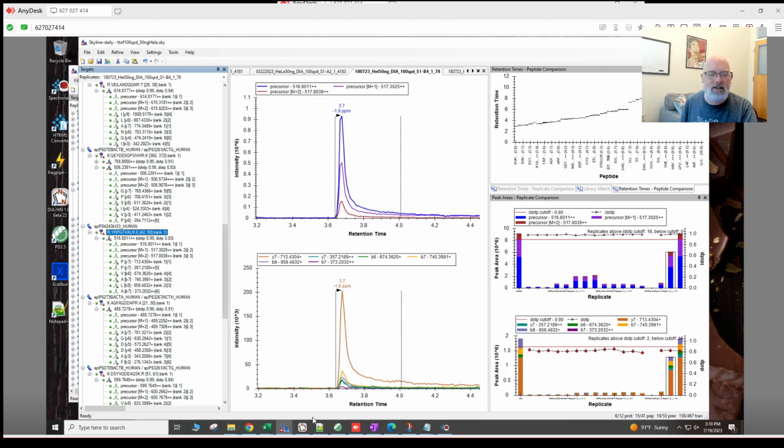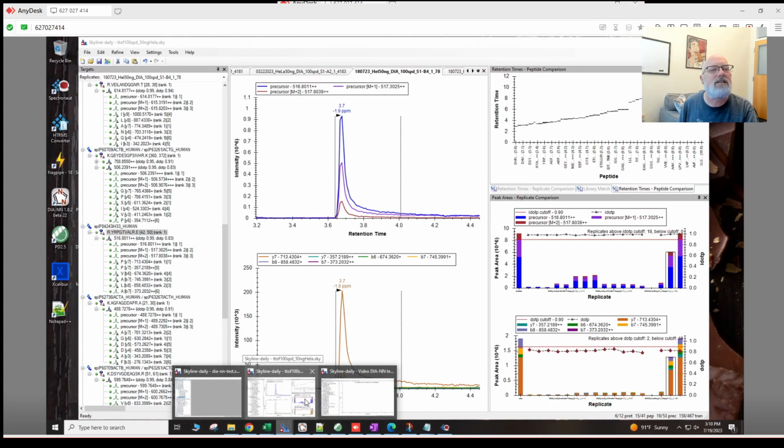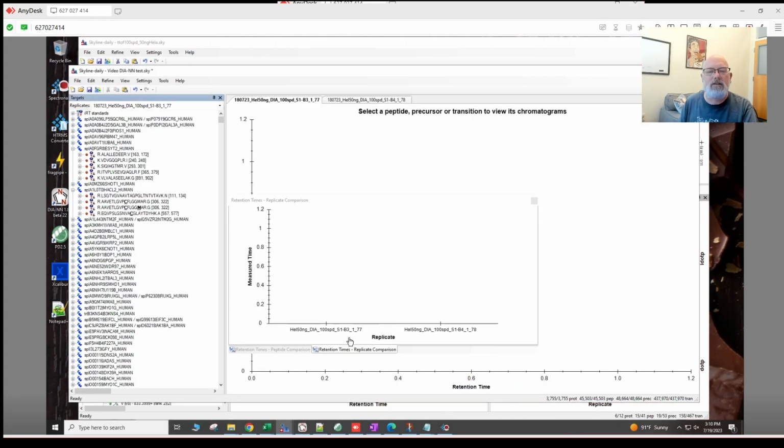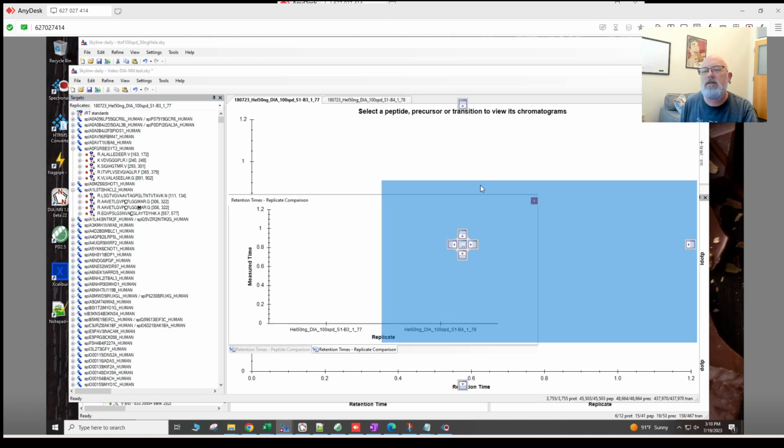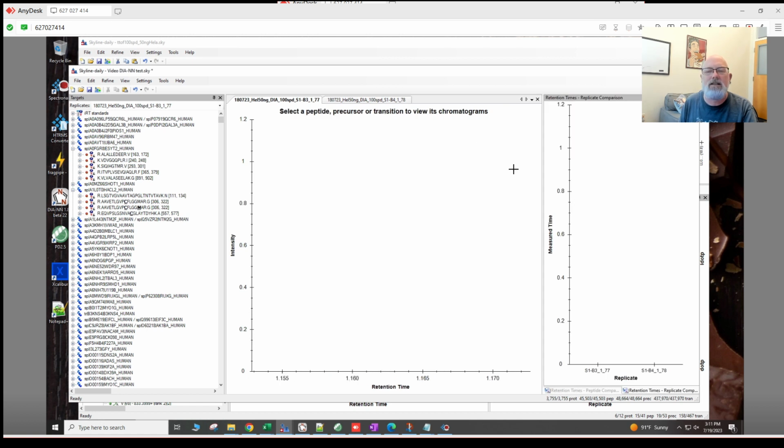Okay, is it done? I think it's finally done. Let's see. Okay, is it done? I think so. Let's move some windows around. Come on. There we go. All right.